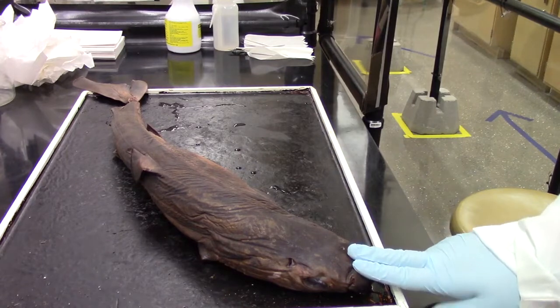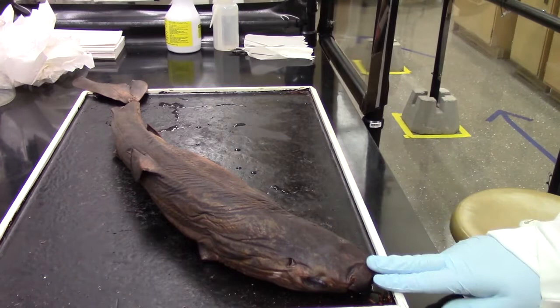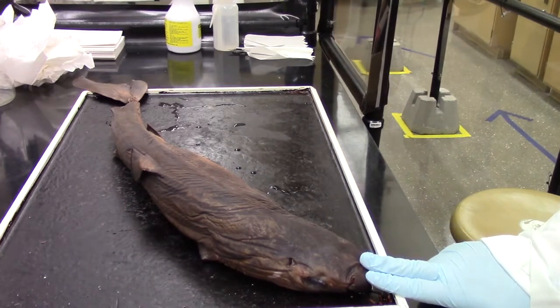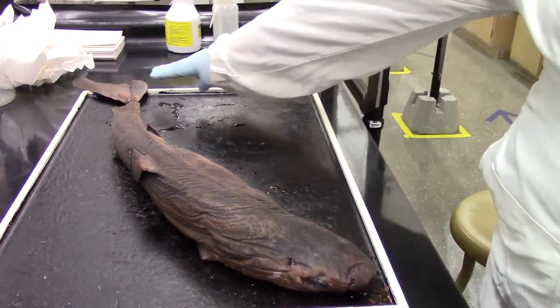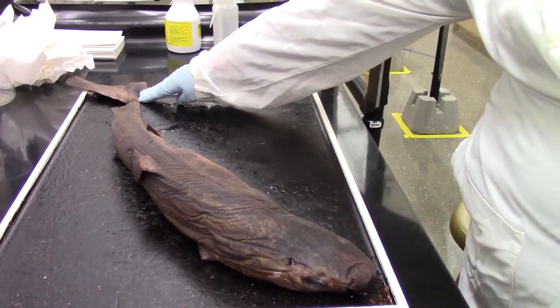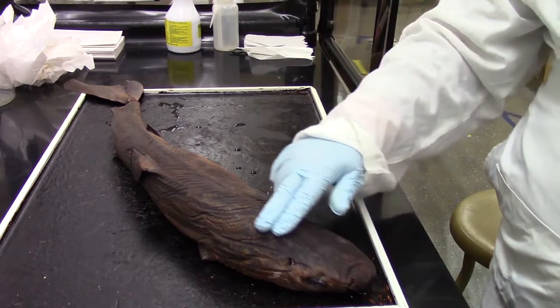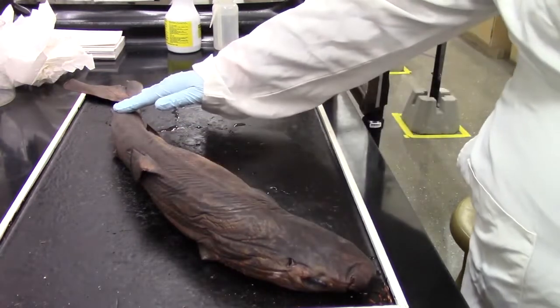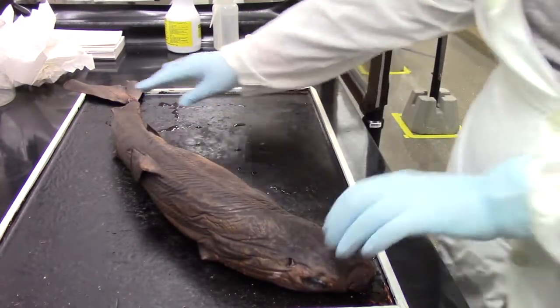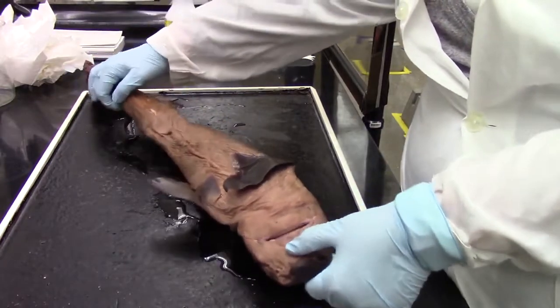So where I have my fingers right now, this is obviously the head of the animal, and we can also refer to this as the cranial end. Opposite to that, here, would be the caudal end. And the surface of the animal that's showing upwards right now is the dorsal. We can turn it over, and this we would see the ventral side.